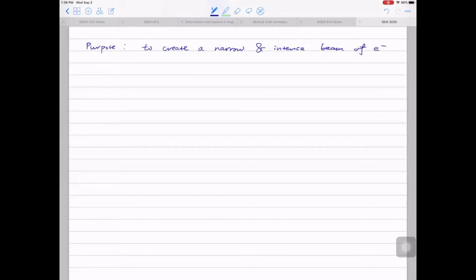Let me ask you, why do we want the electron beam to be narrow? Why? Yeah, but if you use a term we learned last week, why we want... Excellent, I heard better resolution. So the narrow electron beam will give you better resolution.